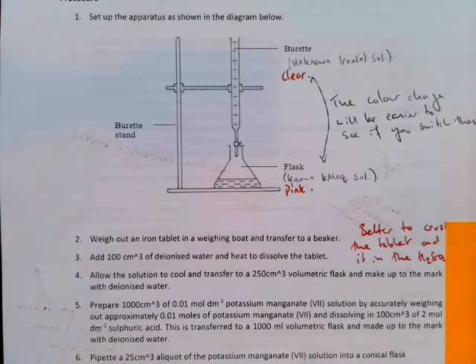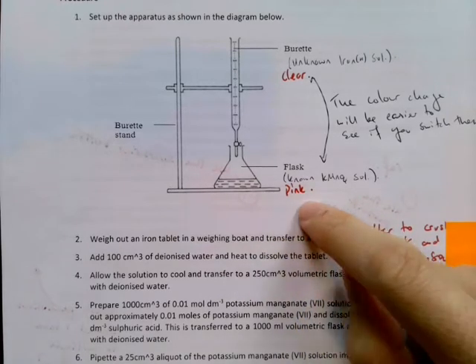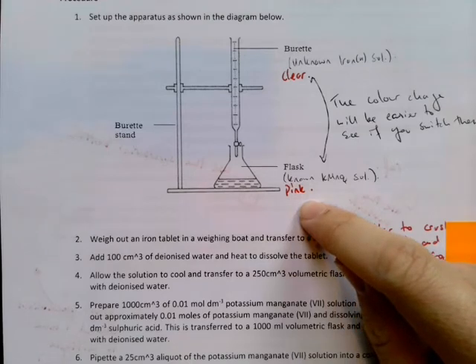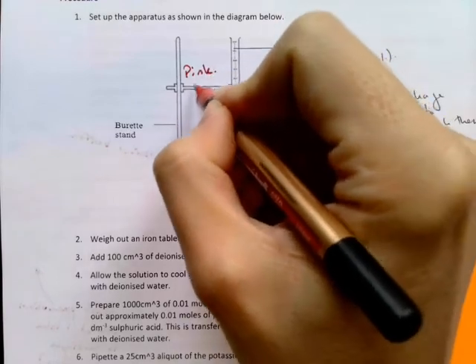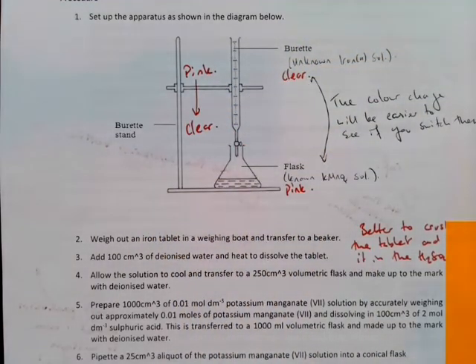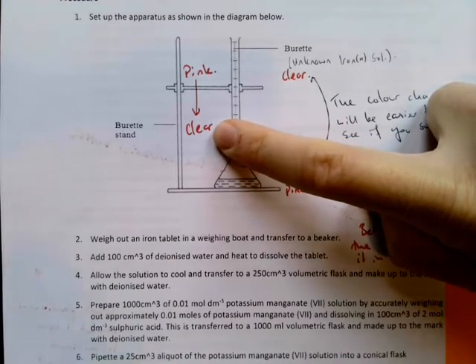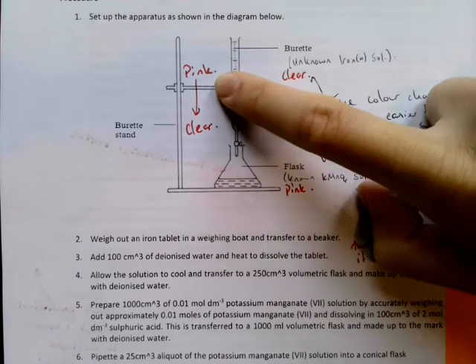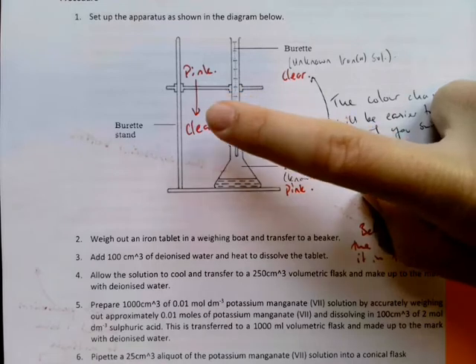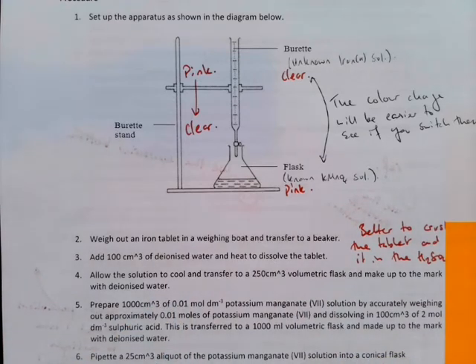The problem with this titration is that if you do it this way round, you need to see the colour change from pink to clear, okay, which might be difficult, because that bit where it just disappears is going to be hard to tell. Whereas if you do it the other way around and you titrate the pink into the clear, you'll see when we actually do this, hopefully, that every drop you add in, this clear solution goes a little bit pink, and then as it reacts, it goes back to clear. Okay, but then eventually that doesn't happen. It doesn't go back to clear, it stays pink. So it's more helpful if you do the manganate solution into the iron solution, so that you can see that colour change. And when we do this, we'll do it on a white tile, which makes it easier to see, like we did with the indicator with the acid base. That'll make it easier to see.